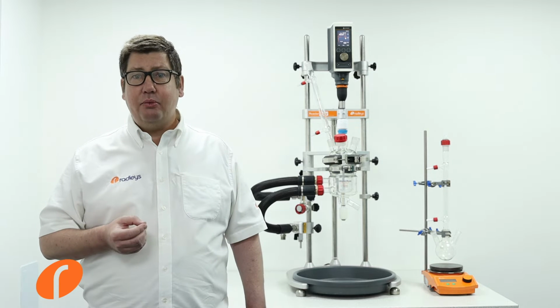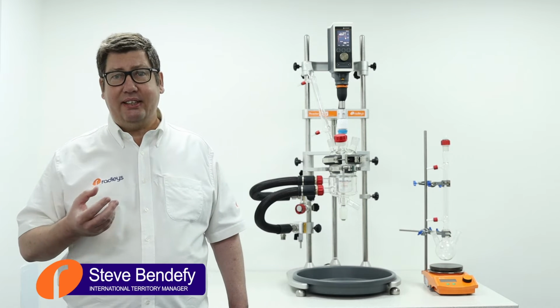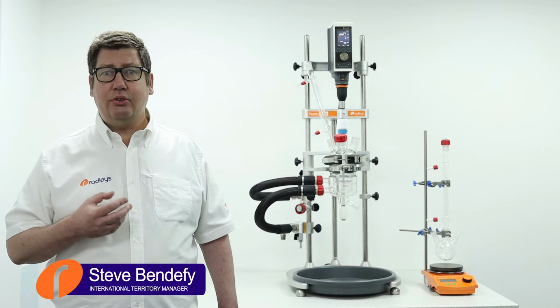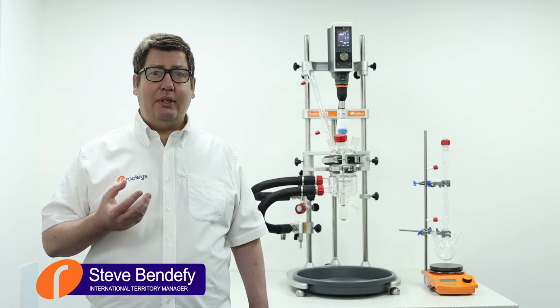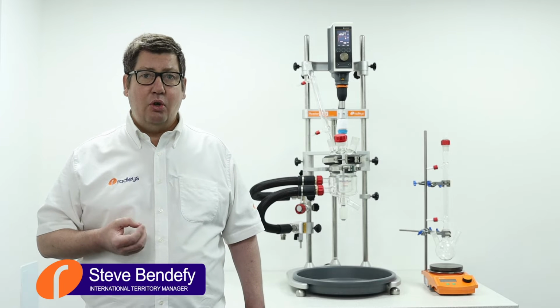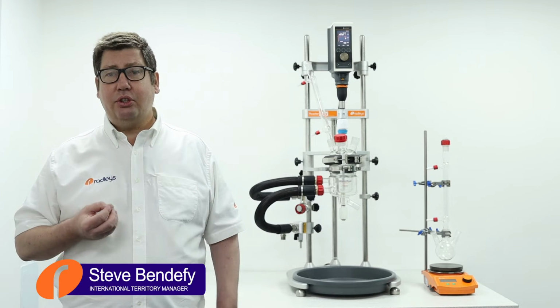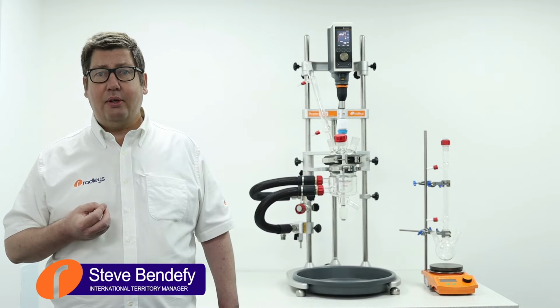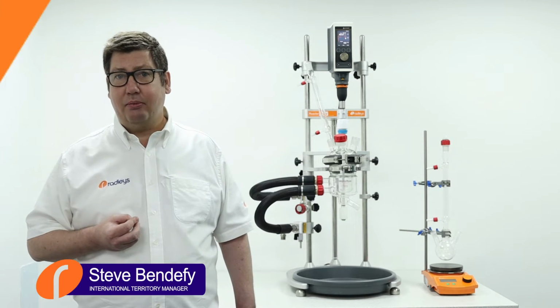Hello, today we're going to look at the benefits of using overhead stirring as opposed to magnetic stirring when carrying out process research and development on a small scale, typically 500 ml sample or less. We're going to look at the techniques used in production and how, if we can use the same techniques throughout the development process as early as possible, we can get better results in scale-up.